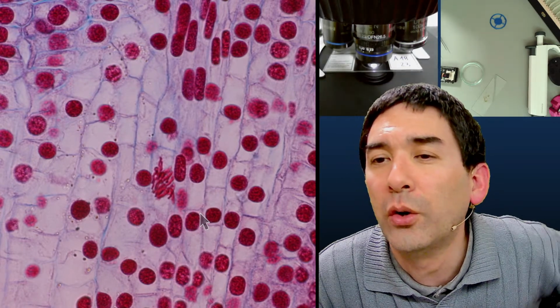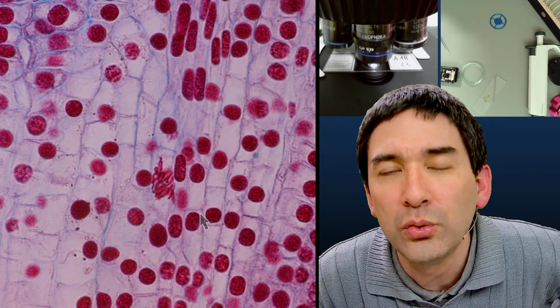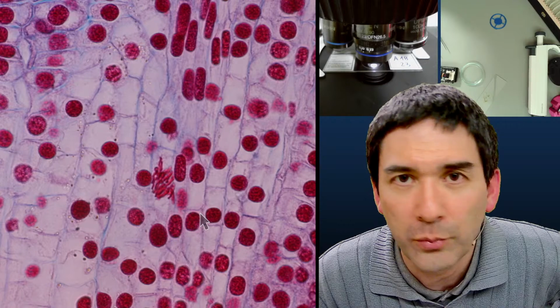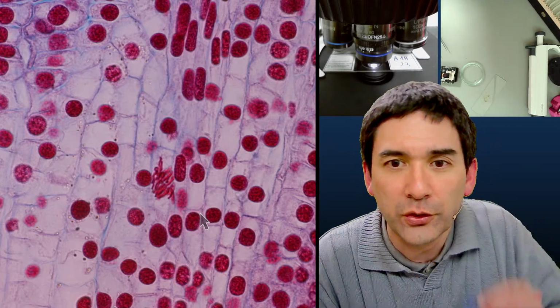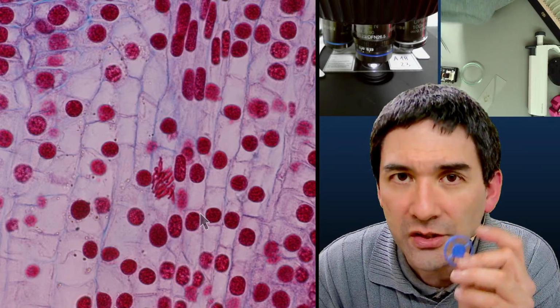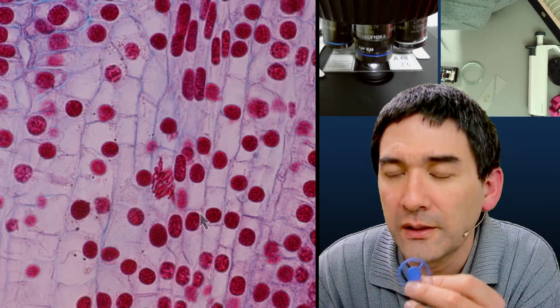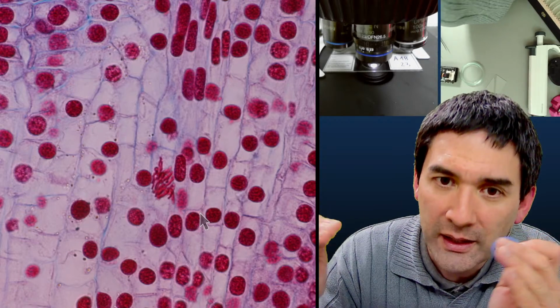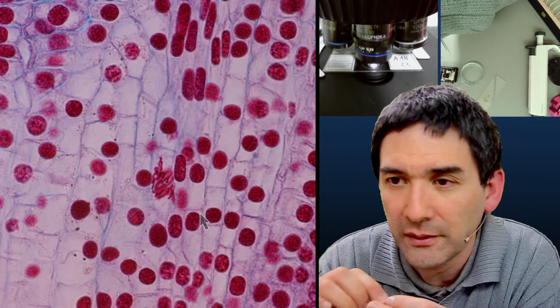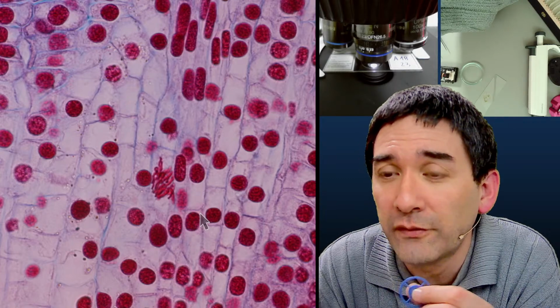I assume that you already own a microscope objective that is made for dark field. Actually, you do not need specific microscope objectives for dark field. The regular objectives work also for dark field. The only thing that you need for dark field is a filter like this, and of course a condenser where you can put it in. Dark field is when the light strikes the specimen from the side and then is reflected into the objective. You do not need dark field objectives. They don't exist.